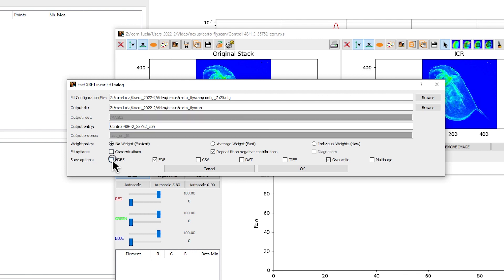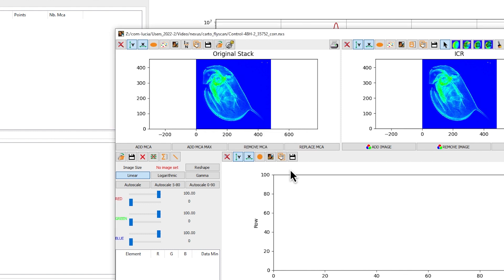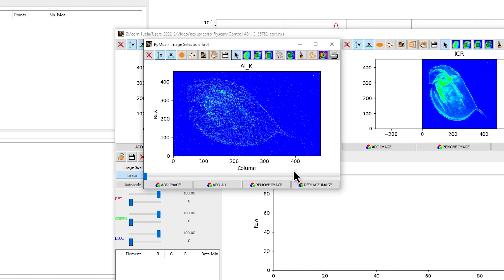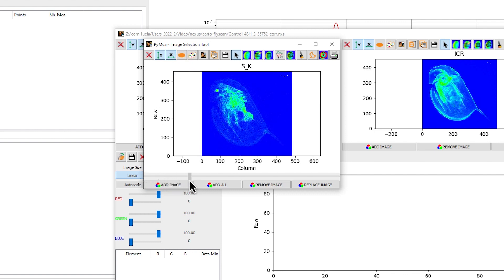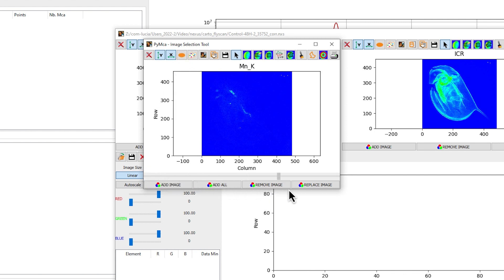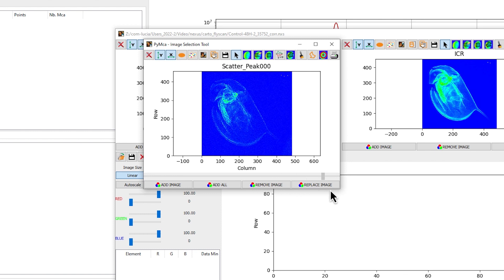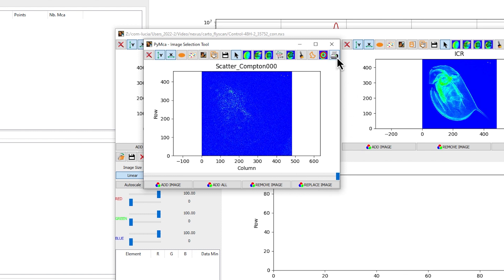We suggest that you uncheck the boxes HDF5 and EDF and check the CSV and TIFF boxes. Click on OK. Elementary maps are plotted on the Pi MCA image selection tool window. You can display the fitted elemental maps by dragging the cursor over the bar. Close the window.